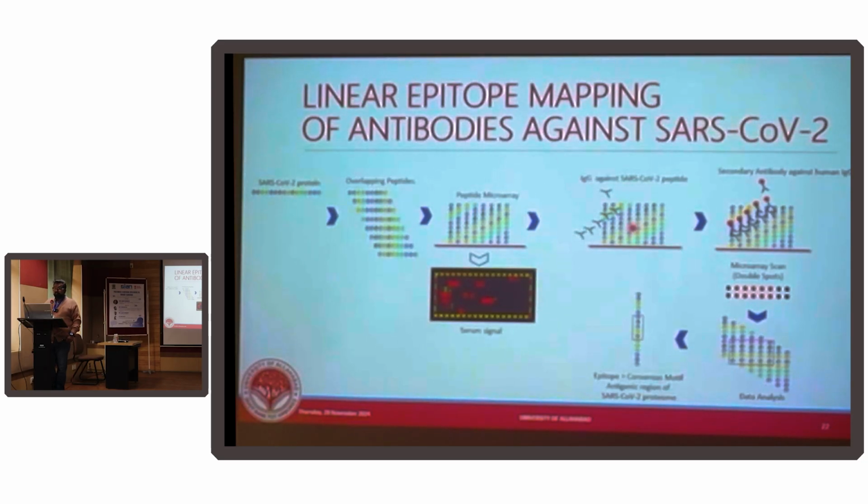Now imagine a specific antibody whose binding site is between amino acid 4 and amino acid 18. That is the motif. It will very weakly, but surely, bind with the first peptide, because there is an overlap.